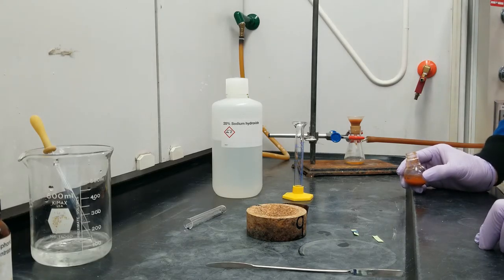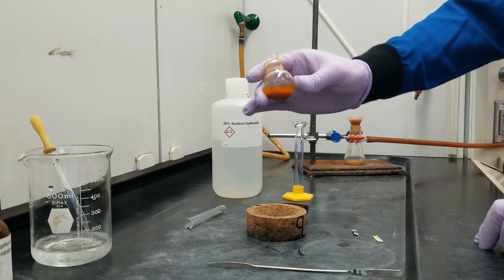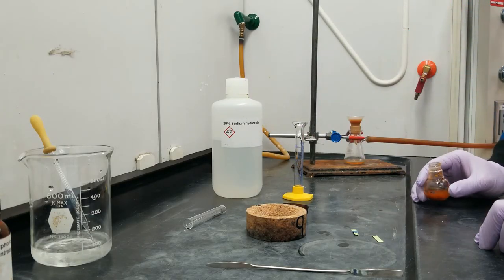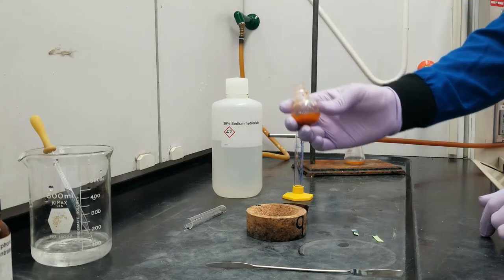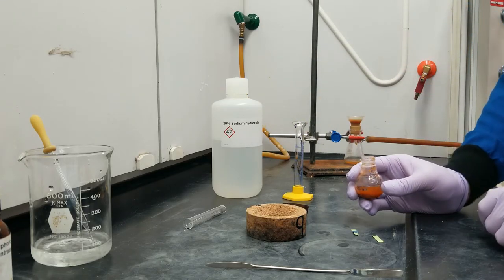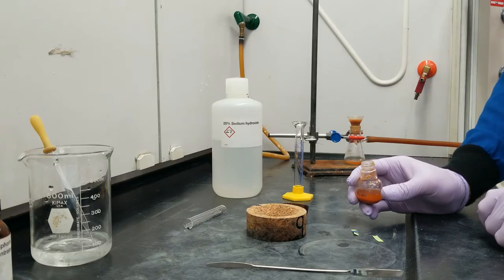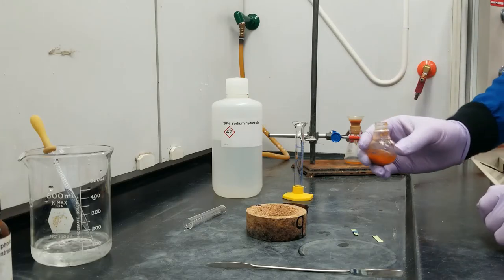I'm only getting like a little dribble out, and I still have actually a lot more solution to go here. This is going to take a while, and it's probably due to really fine particulates in my reaction. Those fine particulates clog up the pores of the filter paper and just make this process a little bit more painful. So this is going to take a couple of pours.